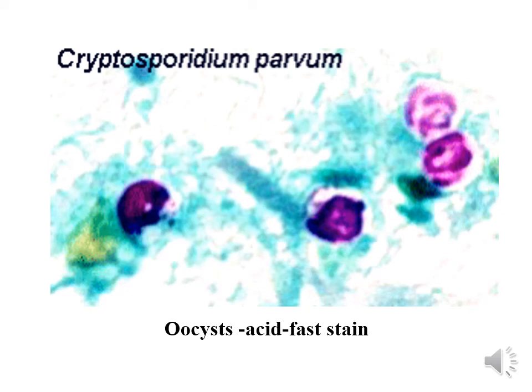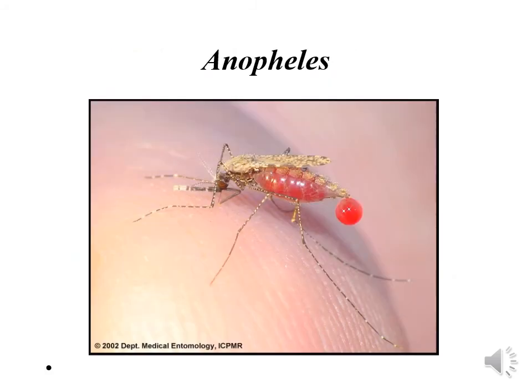Cryptosporidium parvum, usually the oocyst could only be seen by using what is known as acid-fast stain or auramine stain. And usually it could be a pinkish thread in structure. So the oocyst may be containing 4 sporozoites.